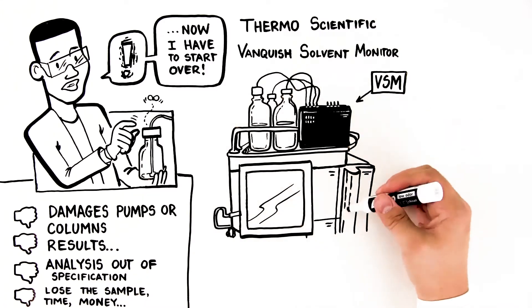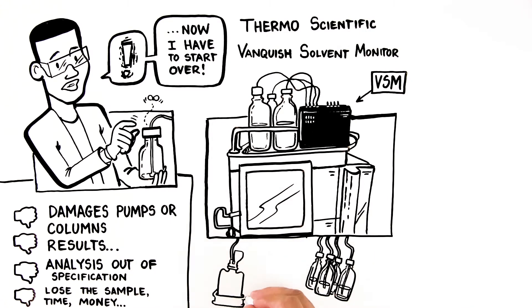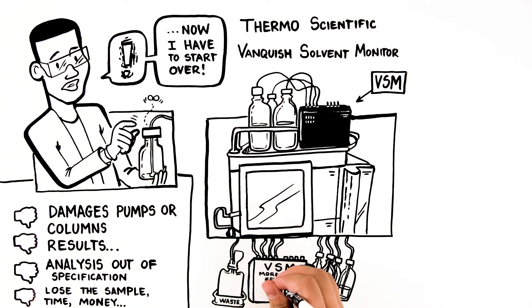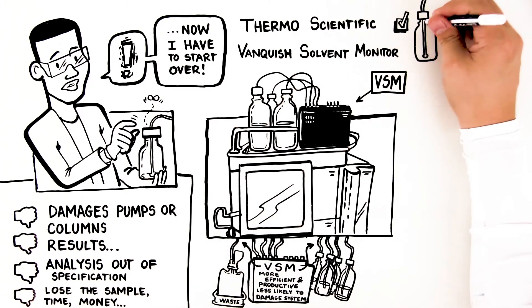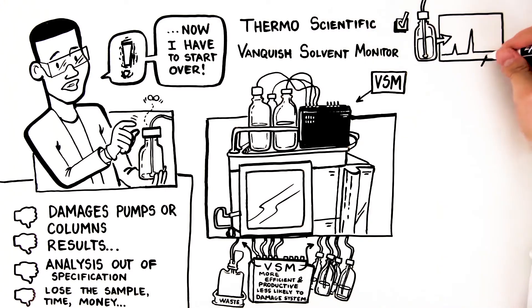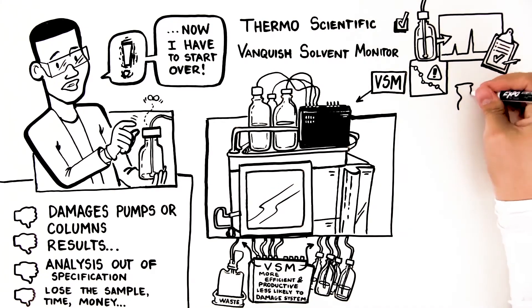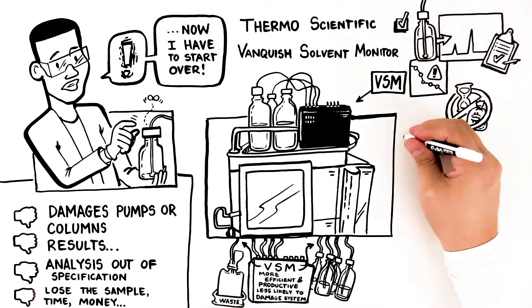Here's how it works. The VSM continuously measures the solvent level in the eluent bottles and waste container of an HPLC system, and automatically takes action if those levels indicate it's in danger of running dry, or if the waste container is close to overspill. This guarantees that eluent levels are sufficient to perform whatever analysis you're running, that you'll be able to report results on time, and you'll have fewer instances of analysis being out of specification.